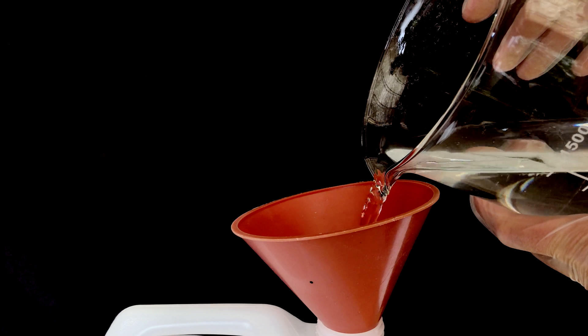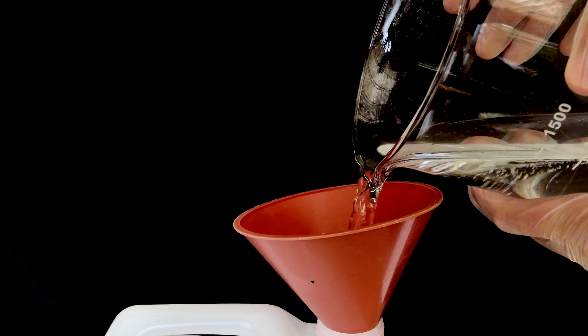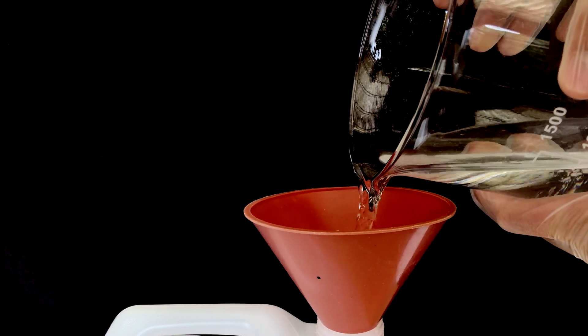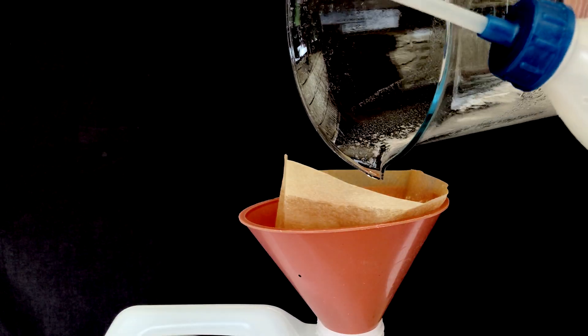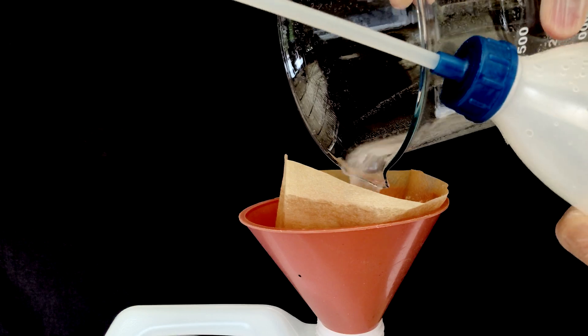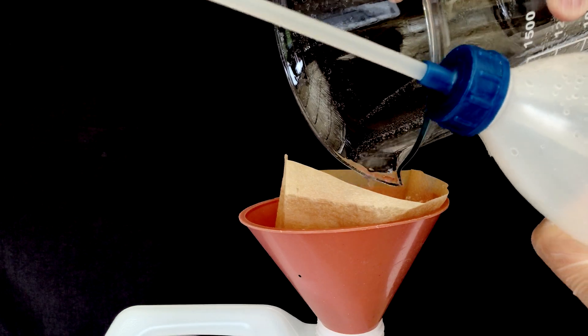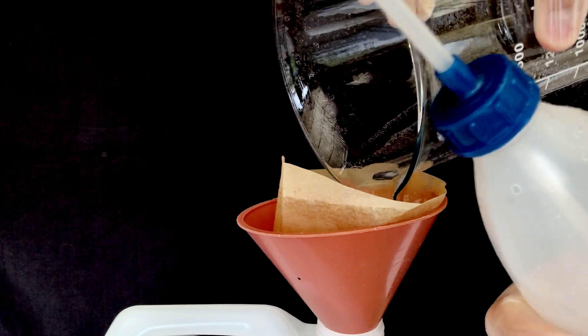Excess liquid was decanted off first before adding a filter to the funnel and filtering off the solids. To ensure no mercury thiocyanate is left behind, the beaker was rinsed using distilled water while holding it at an angle.